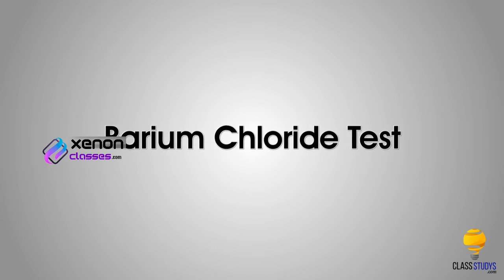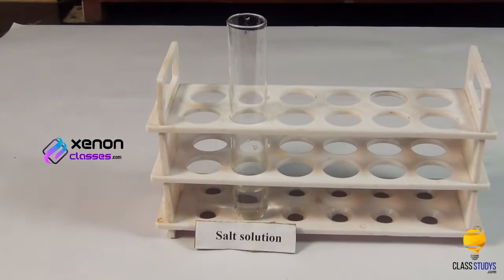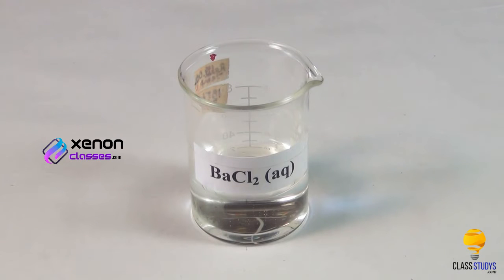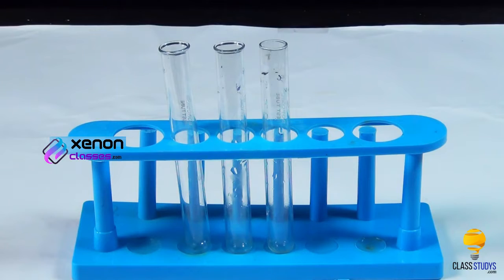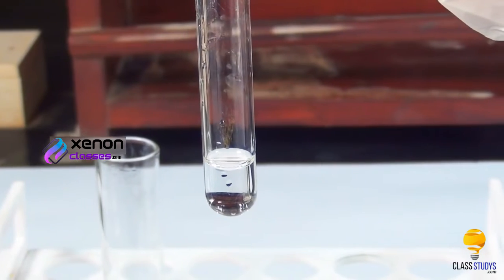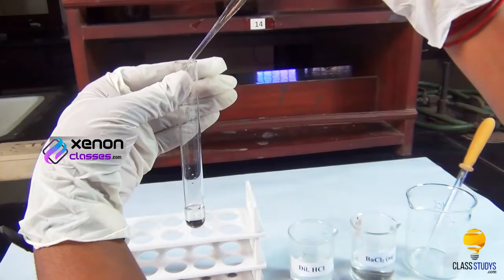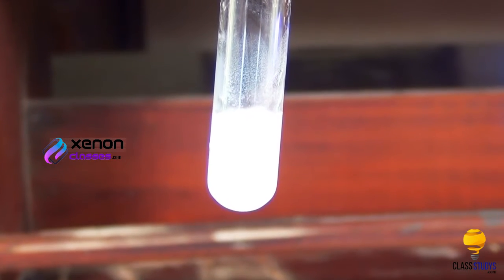Barium Chloride Test. Materials required: aqueous solution of the salt, barium chloride solution, dilute hydrochloric acid, test tube and droppers. Procedure: take a small quantity of aqueous solution of the salt in the test tube. To this, add a small amount of barium chloride solution using a dropper.